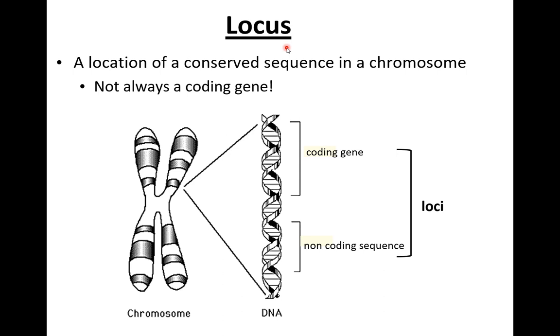You will look for a hair, get the hair follicle, and try to extract the DNA, or from cigarette butts, and any possible evidence from whatever weapon was used. You can try to get some biological samples there, remains of skin left, or underneath the nails of the victim, who usually fights back, right? You extract the DNA, and then you could study that DNA by PCR and try to see if it matches any possible suspect in that murder, right? How do you do that?